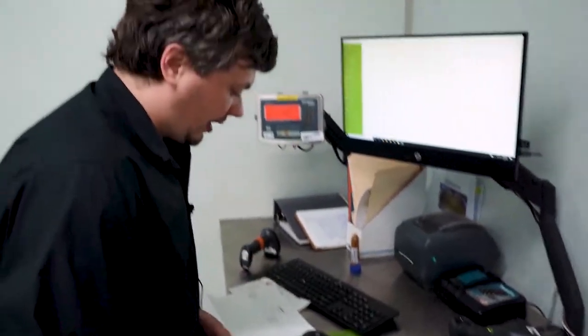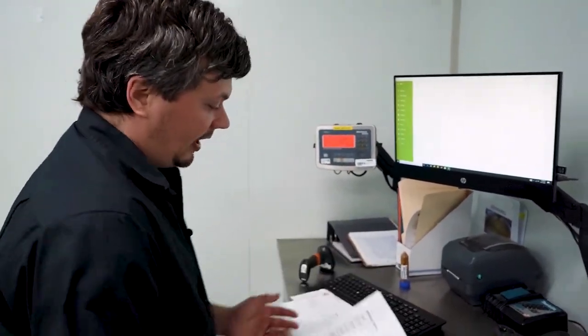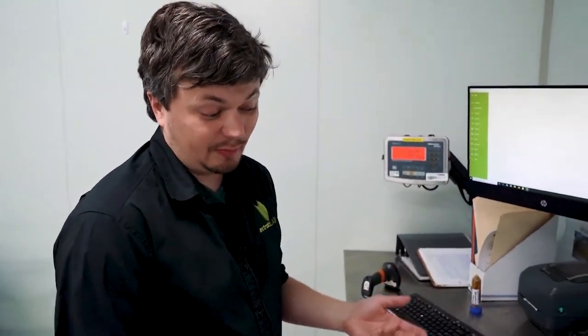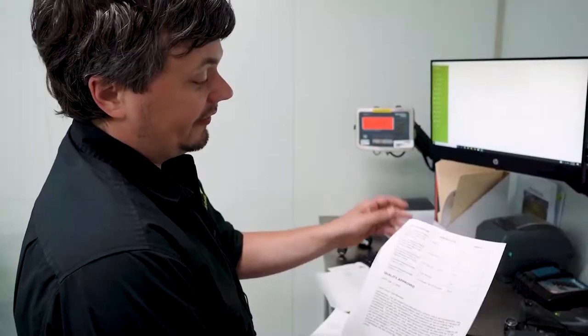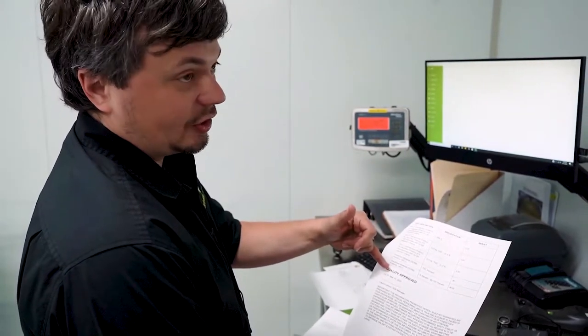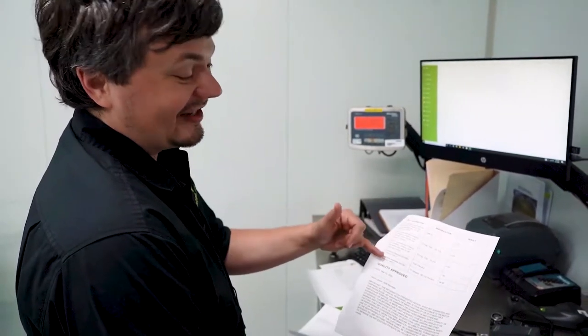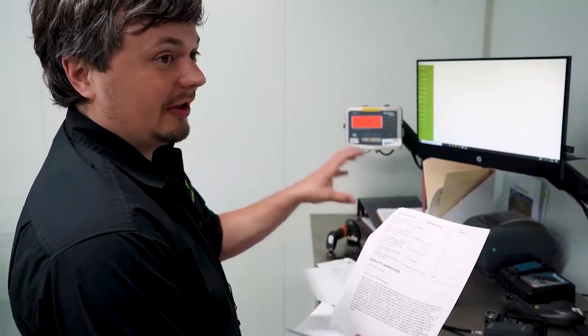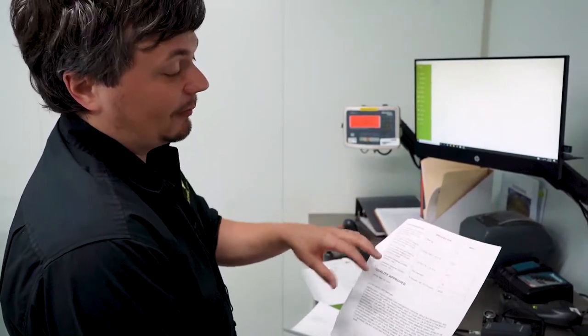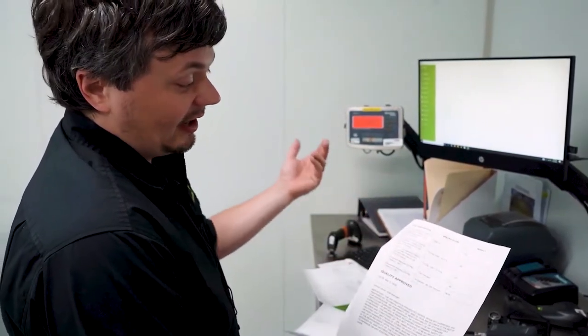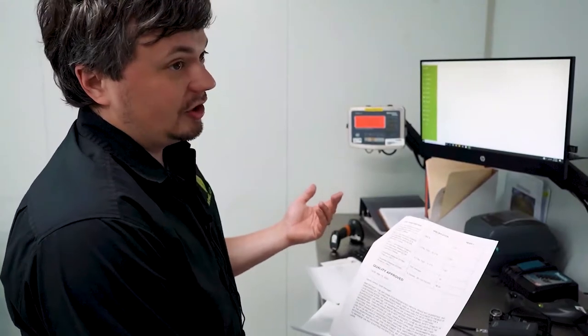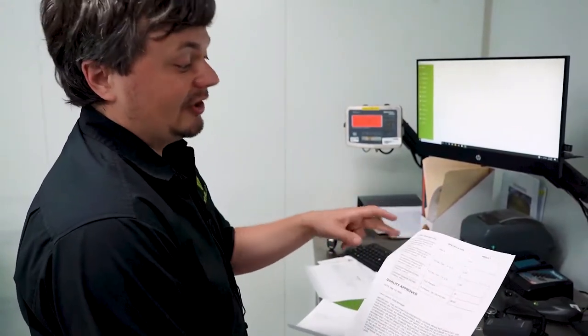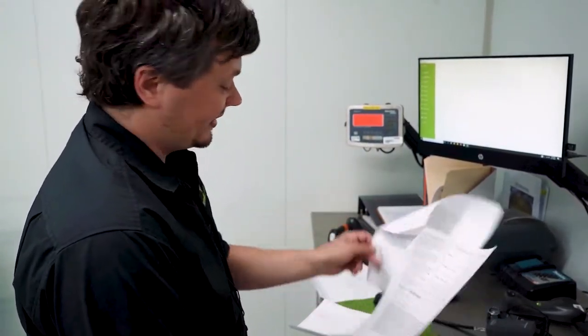Since this is a sampling event, this sample would go down to the lab. And if you have purchased the analytical station, what you can do is you can actually print out your own C of A's. All of these test descriptions and all of these analytical tests are completely customizable. They were programmed in by this particular operation to look for these things. But if you wanted to do a screening for every kind of pesticide, you could enter them in here with action limits.